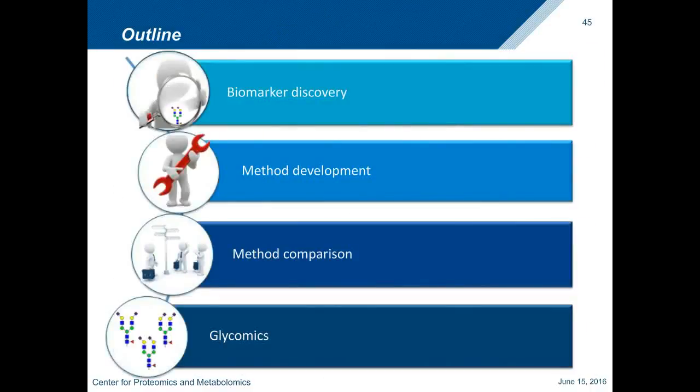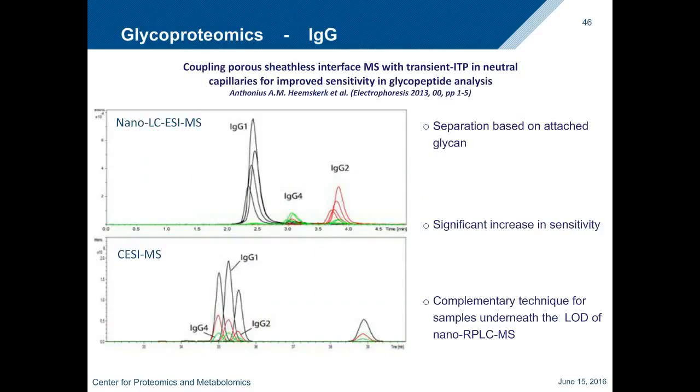So that was the method development, and we thought, okay, it looks pretty nice, we get higher charge states, higher sensitivity, but how does it really compare to the different analytical platforms that are already out there for glycomics analysis? So first of all, we want to compare it to nano-LC-MS. And we want to compare it to nano-LC-MS because we thought it's the most fair comparison to make because nano-LC is also a microscale separation technique. And as it's also microscale, we also have the same mass spectrometer behind it in our own lab. So we thought that's the most fair comparison that we can make.